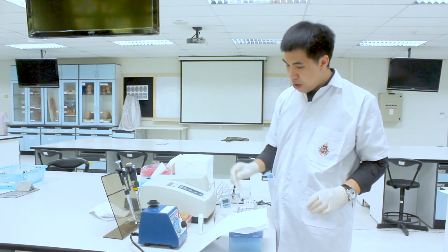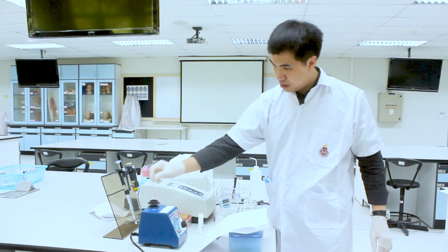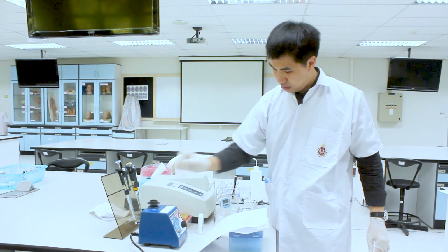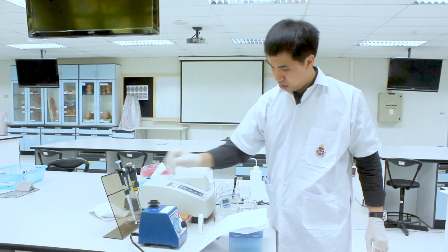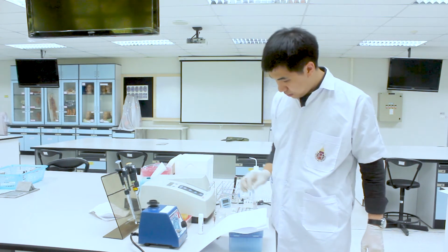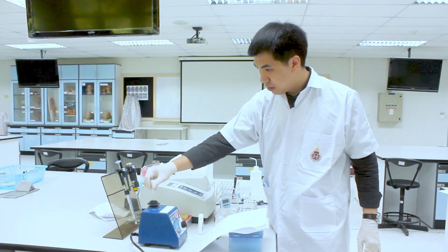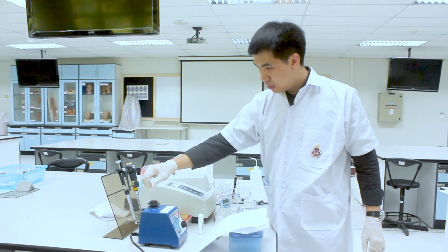Okay, we just mix it with vortexing. After vortexing, you leave all the tubes for 5 minutes before you measure the OD value with the spectrophotometer.